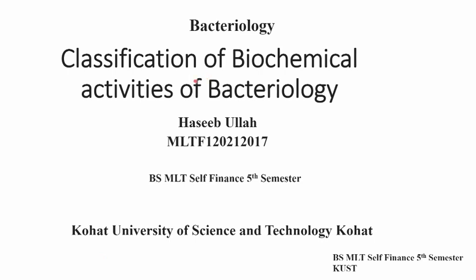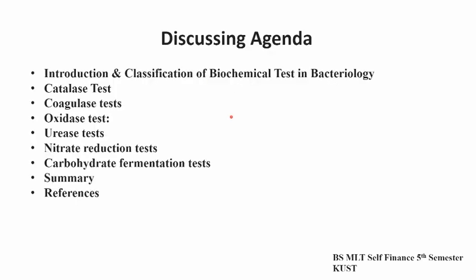Today my presentation topic is the classification of biochemical tests in the bacteriology lab. In the agenda, firstly we will introduce the biochemical tests and their classification. Then we will discuss the catalase test, coagulase test, oxidase test, urease test, nitrate reduction test, and carbohydrate fermentation test. At last, we will discuss a summary of all the tests.